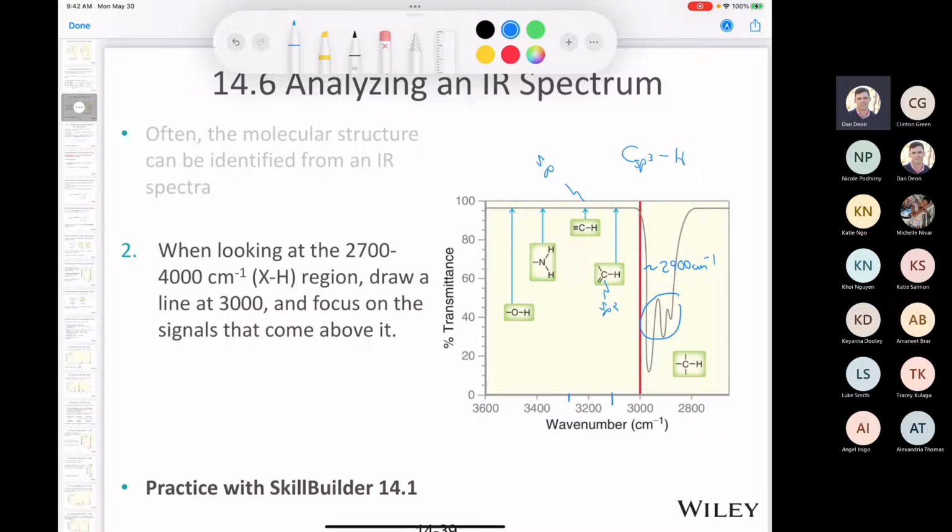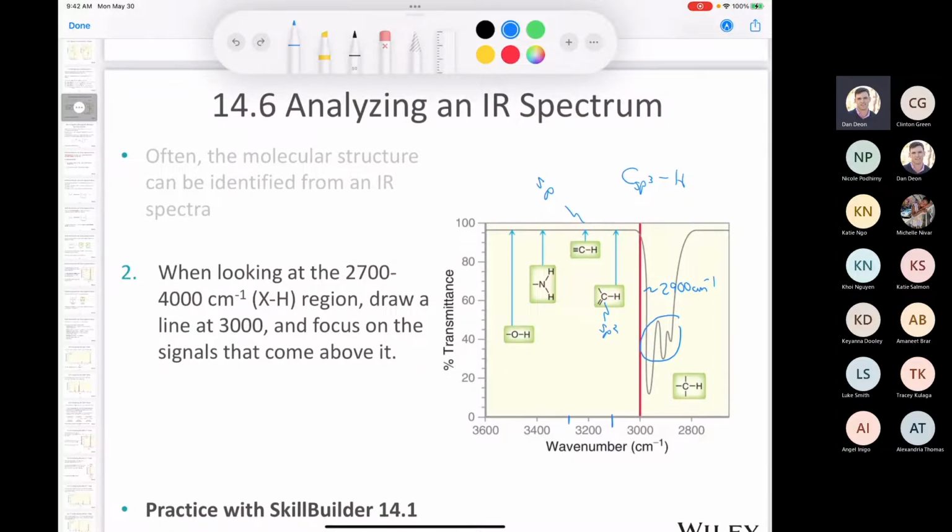We talked about primary and secondary amines, which have stretching between 3250 and 3550, and the difference between symmetric and asymmetric stretching. Then of course there is oxygen-hydrogen stretching, which we find in alcohols and carboxylic acids. That is usually the easiest thing to recognize in an infrared spectrum, and we're going to take a look at an example of that in just a couple of minutes.